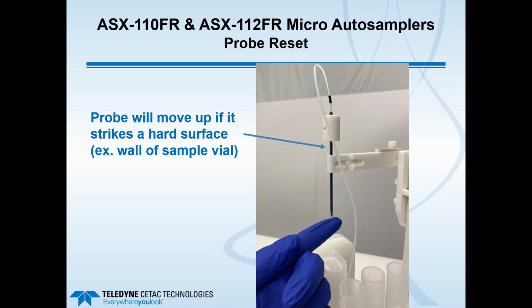So we can call it a probe reset function, and that allows the user to go ahead and correct the issue, such as if it's an alignment problem.